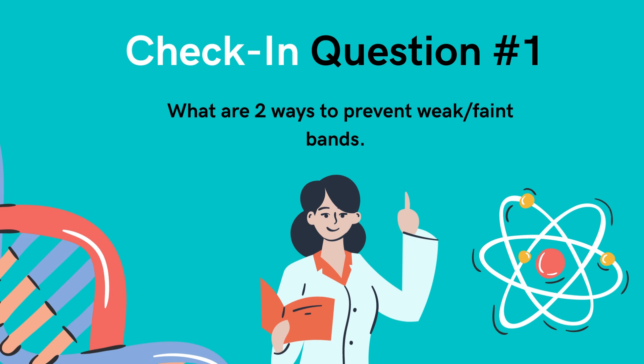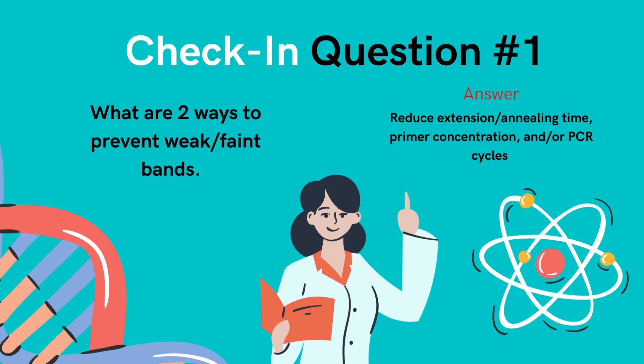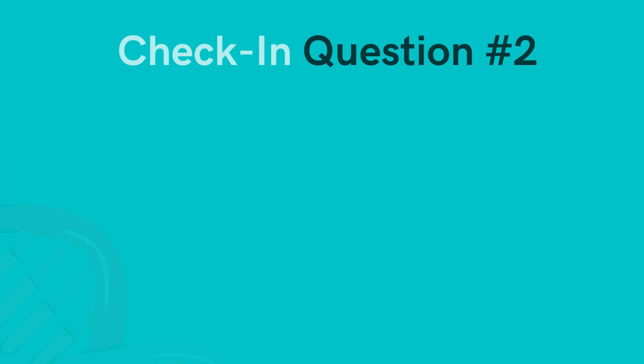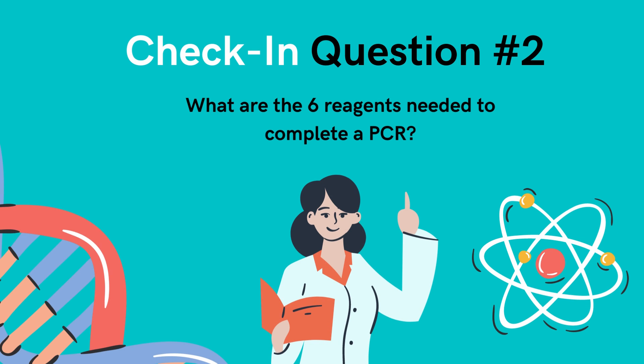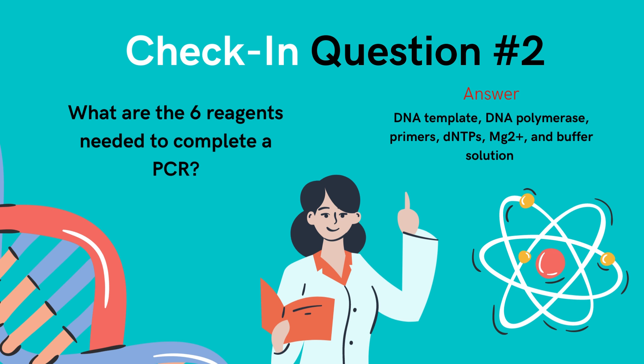What are the two ways to prevent weak or faint bands? Reduce extension or annealing time, primer concentration, and/or PCR cycles. What are the six reagents needed to complete a PCR? DNA template, DNA polymerase, primers, dNTPs, magnesium, and a buffer solution.